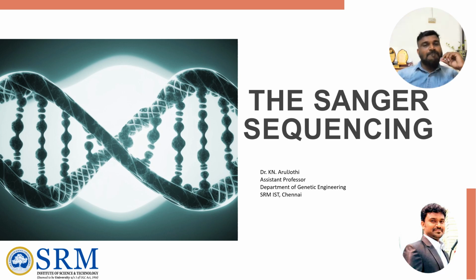In this lecture, we will be covering the principles and key concepts of Sanger sequencing, and also we'll go through the workflow of Sanger sequencing.